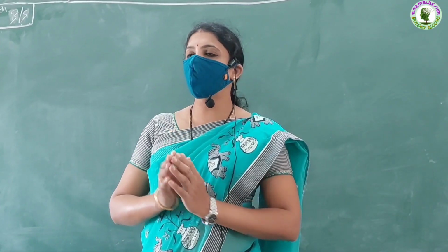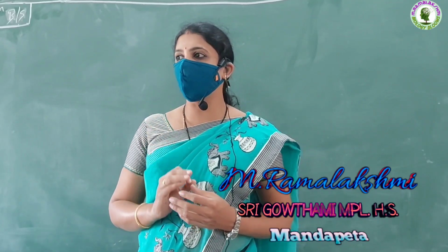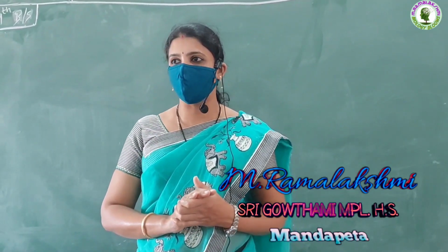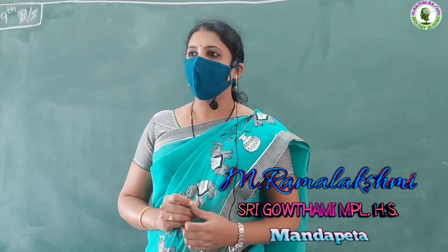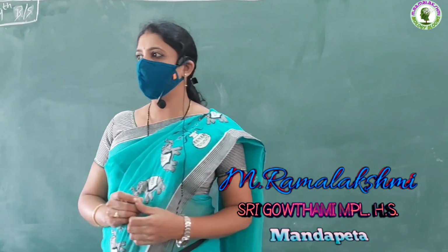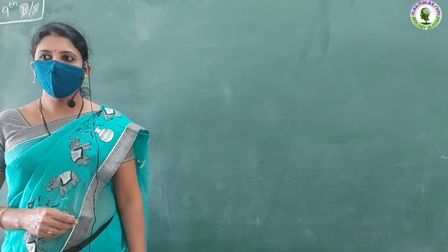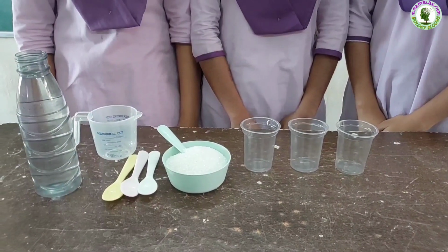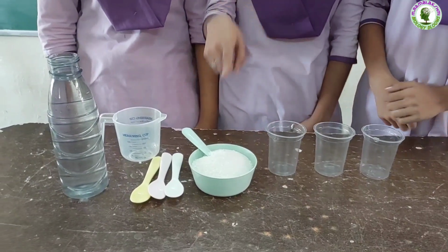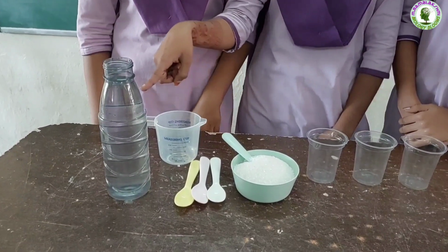Children, already we learned about saturated and unsaturated solutions. Now, we will discuss the concentration of solutions. To know about the concentration of a solution, we will do an activity. To do this activity, Nohita, Amruta, Kirti, come here. We need 3 glasses, sugar, spoons, measuring jar and water.